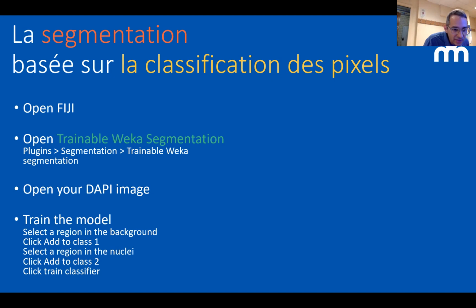Okay, how is this selection different from doing it by hand? Well, because you don't do all of them, you just do some of them, and then you can propagate them. Also, when doing it by hand, the human eye is very, very good at discriminating shapes and finding things, so it's very hard for a computer to reproduce that. But the idea is to be able to create a model and then apply it in an unbiased way, or propagate it to the rest of the data.